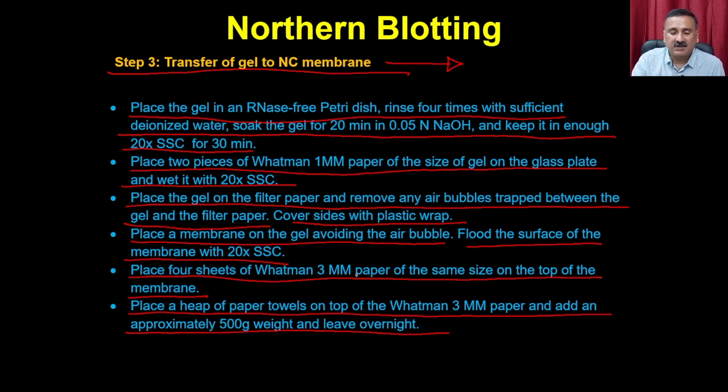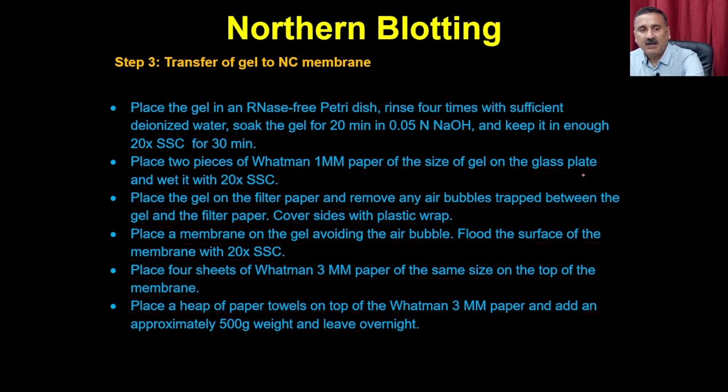So what we are describing here is the capillary action transfer that we have already discussed for DNA in the southern blotting. This is the procedure, right. Now, once step 3 is done, your RNA is going to be transferred onto the nitrocellulose membrane, and then you are going to have the next step.